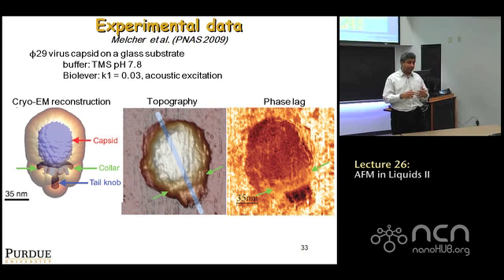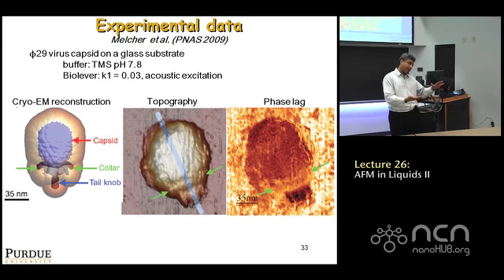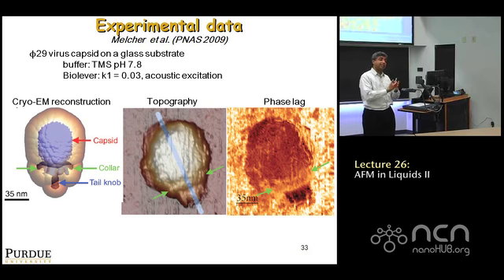What one expects to see if you do humidity control, as far as phase contrast is concerned, is, remember, when the tip interacts with the sample in air, there's always this layer of water, and a meniscus that forms and breaks. There is evidence that as you increase humidity, the losses due to meniscus making and breaking start dominating what you see in cantilever dynamics and phase contrast. There are some good papers that have tried to prove that by controlling humidity and having samples with regions of hydrophilicity or hydrophobicity, you can tell from phase contrast which is which. Because on a hydrophilic region, you have a lot of liquid layer and therefore it is lossier, because the mechanism of loss is mostly this making and breaking of meniscus.